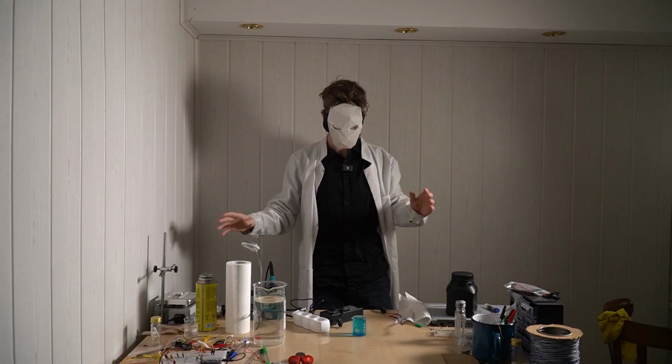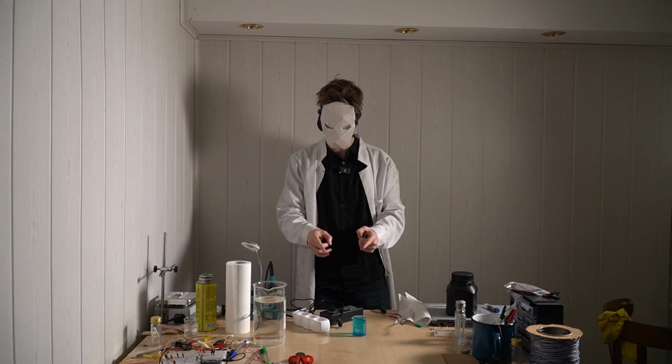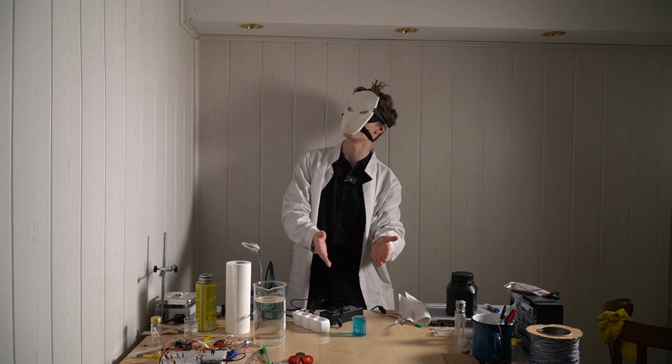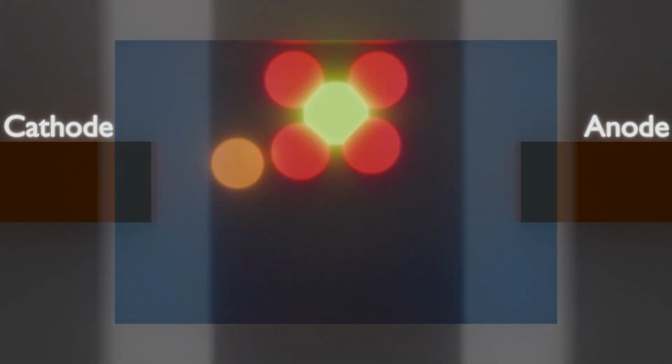Wait. Electrolysis? And right now I'm trying to do electrolysis. Harry, you're an electrochemist. Do you have any idea why this wouldn't be working? Basically, your acid generation reaction relies on two half reactions, one occurring on each electrode. A reduction happens on the cathode and an oxidation happens on the anode. Now, on your cathode, the easiest reduction half reaction to do is the reduction of copper ions into copper metal. You're using copper sulfate specifically because copper ions are so easy to reduce and effectively remove from solution. There are no issues here.